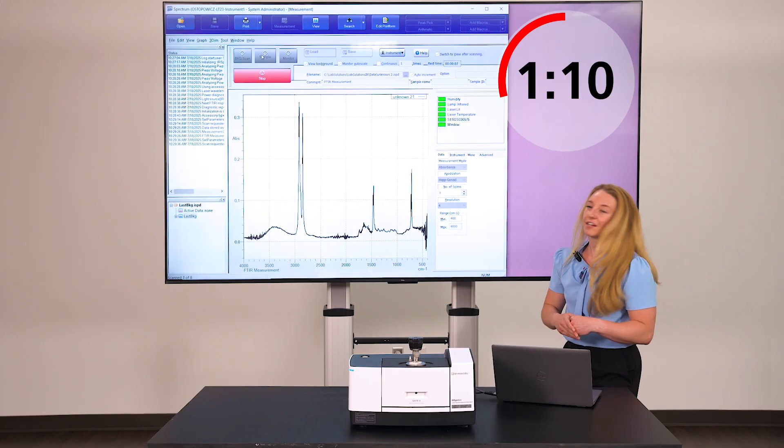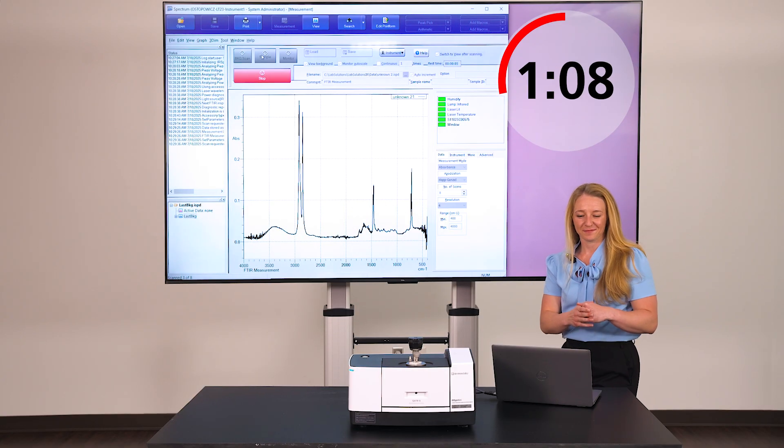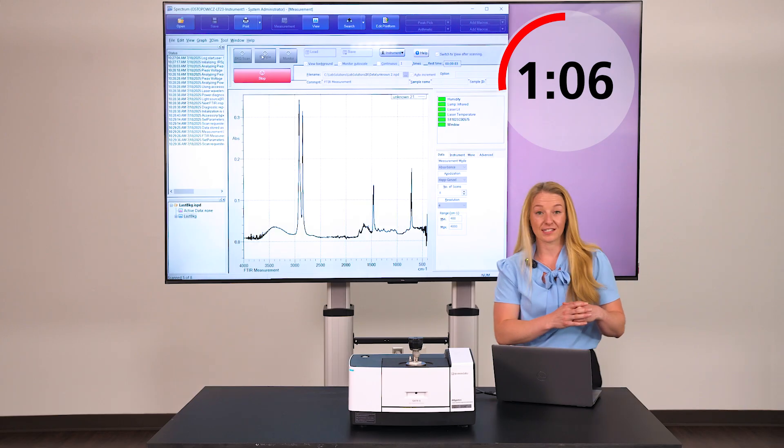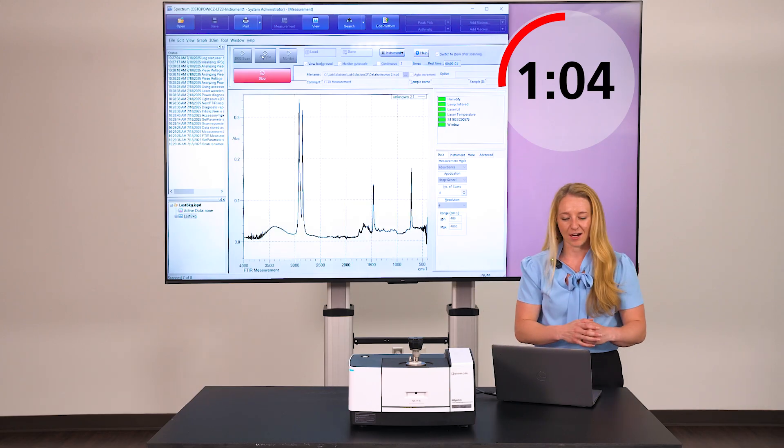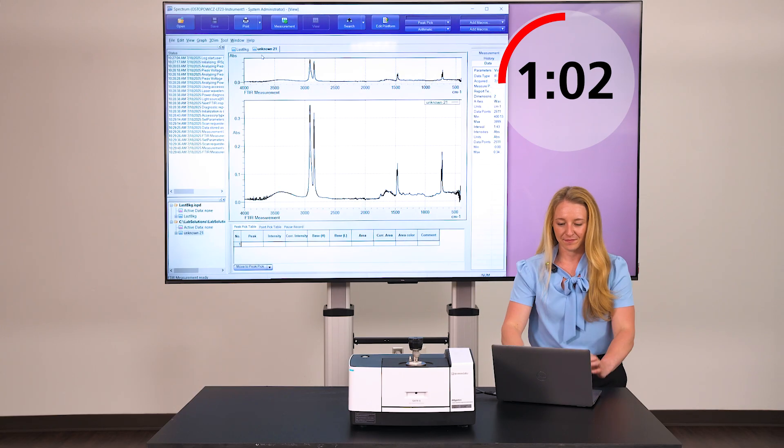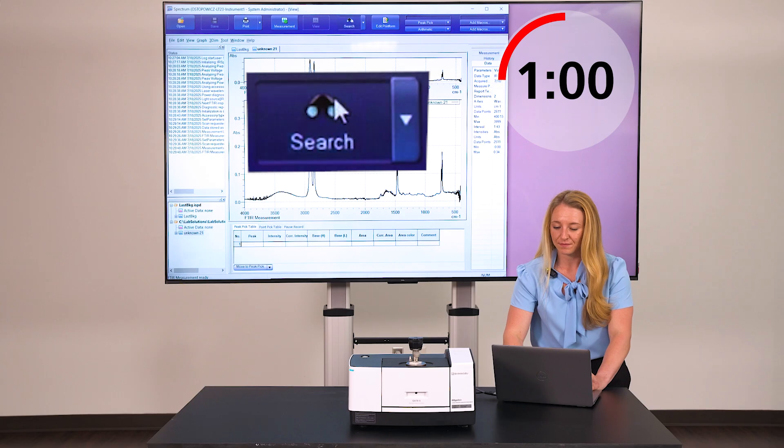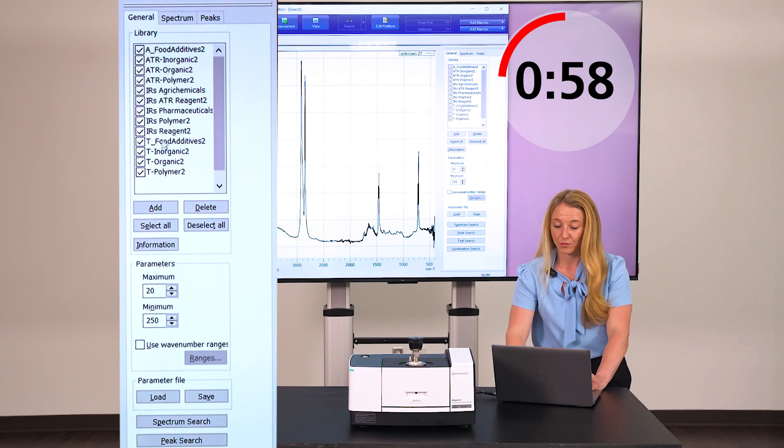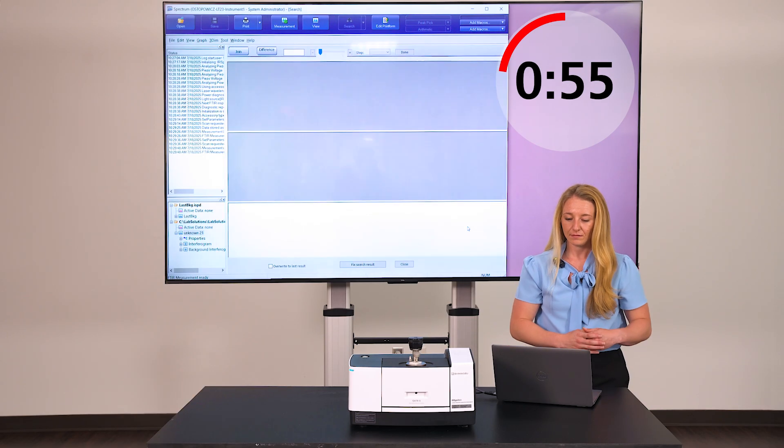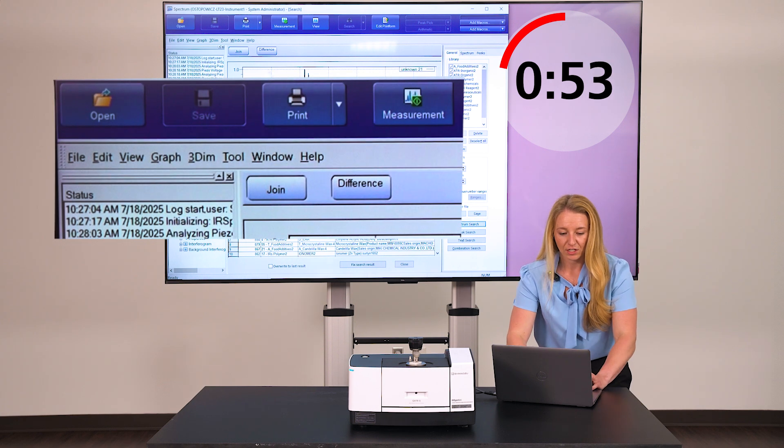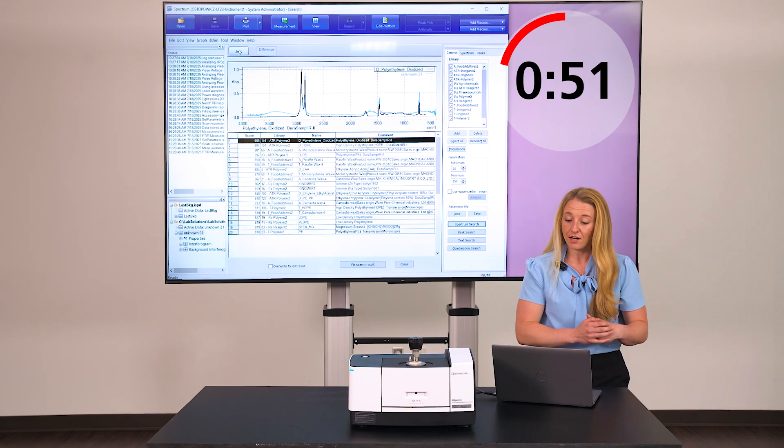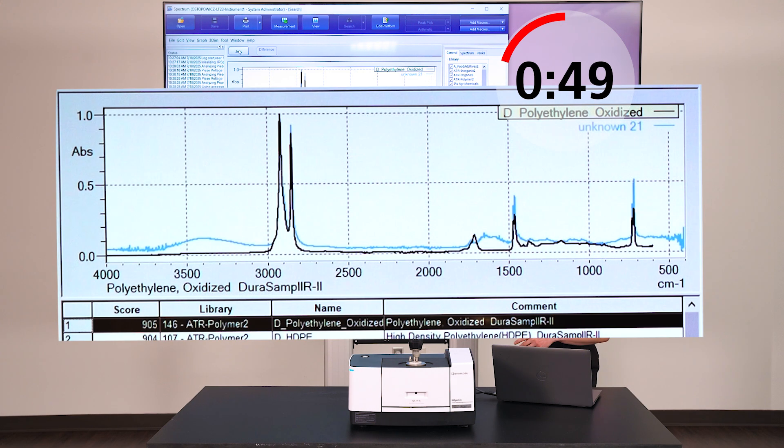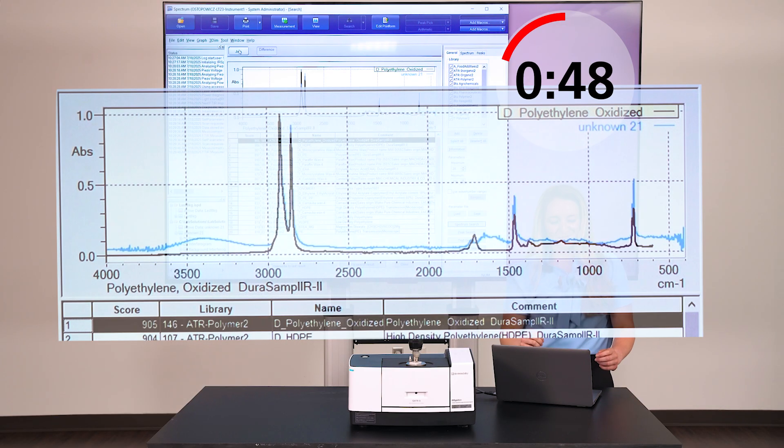And here is our unknown spectrum. In order to identify it, as soon as this is complete, we will search it against the libraries available. Simply select search. Select the libraries you wish to search. And we can see that our unknown agrees very well with oxidized polyethylene with a score of 905 out of 1000.